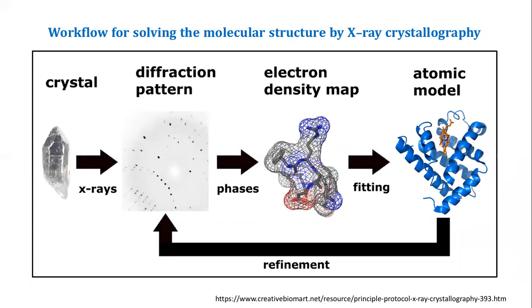The structure of the atomic models can be made, and at different angles we can have the diffraction patterns. By looking at the different ways in which the atoms are arranged, the electron density map at different angles, you can form atomic models and validate and refine these models until you get the same diffraction pattern of a known particular pure compound. And that is how, with computational methods, we come to the structure of that particular compound.